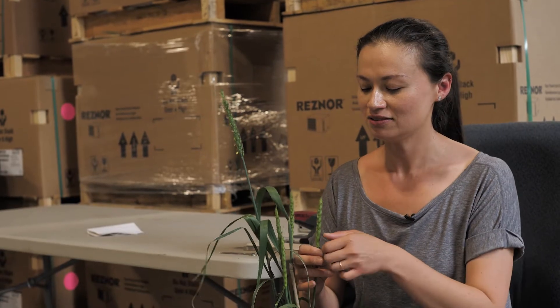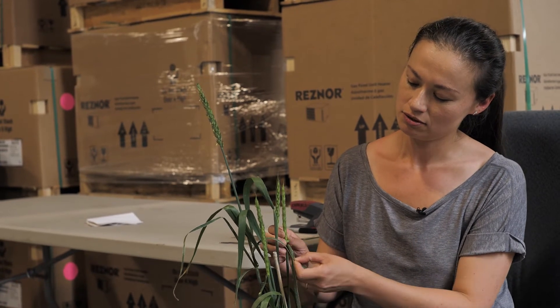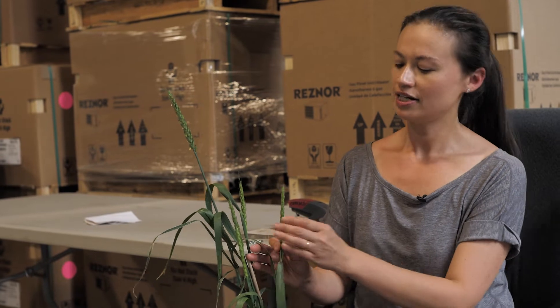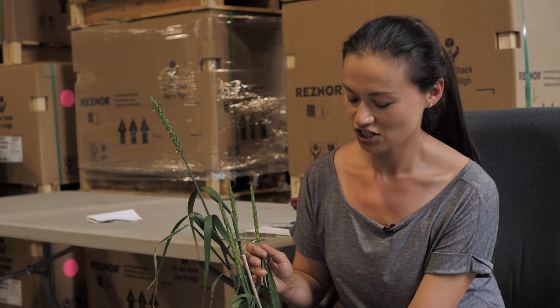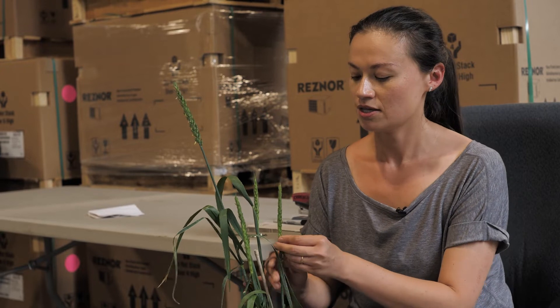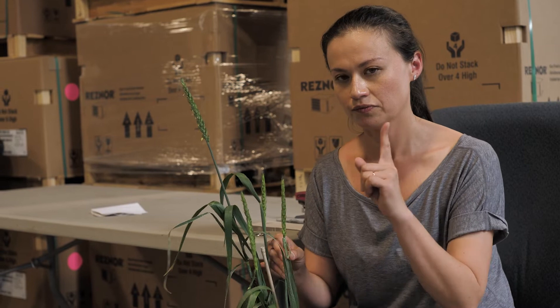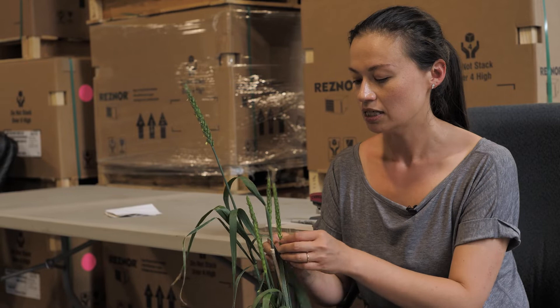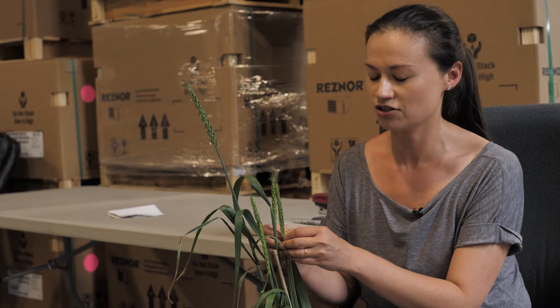We have to take out the anthers. This is called emasculation — taking out the male parts. On our wheat plant we have a pistil that's white, and the pistil is surrounded by three anthers. Any time you see a pistil you've got to pull out all three anthers. If you're only pulling out two, you've left one behind and you're going to self-pollinate.